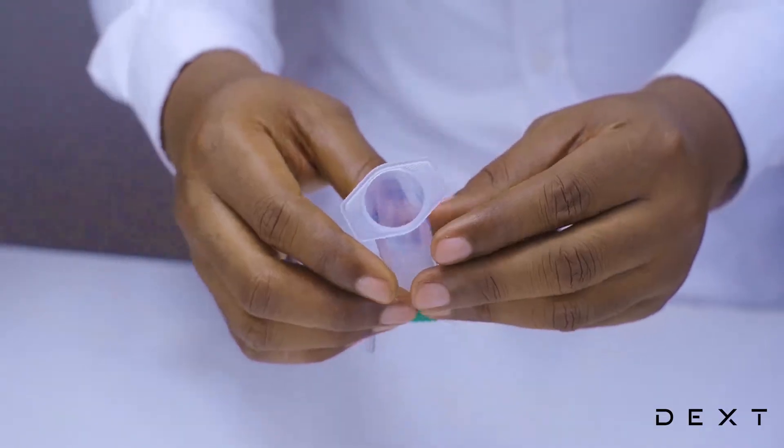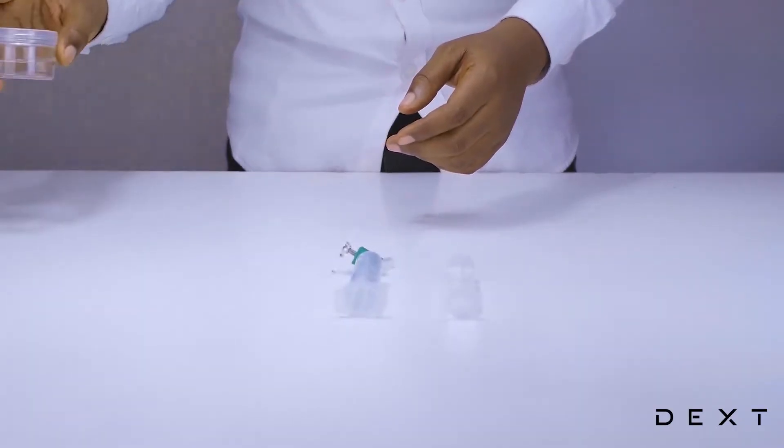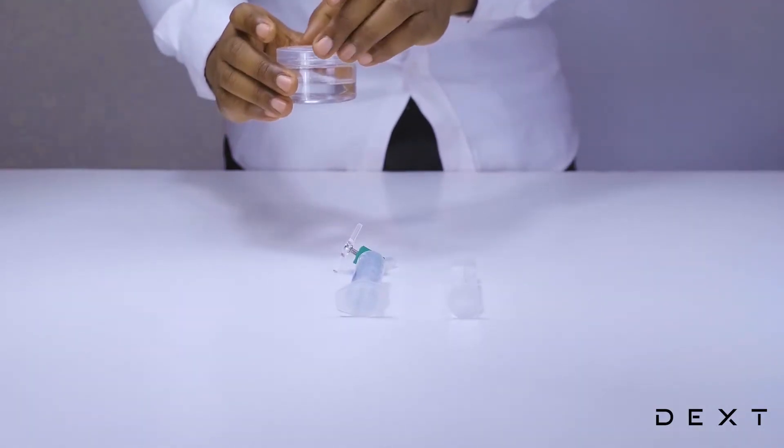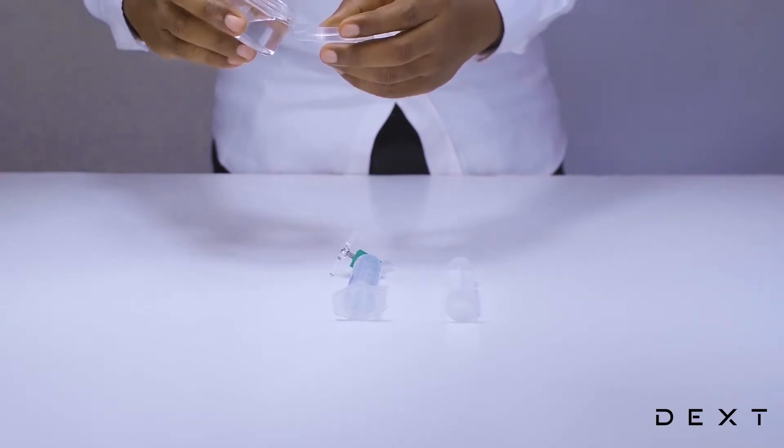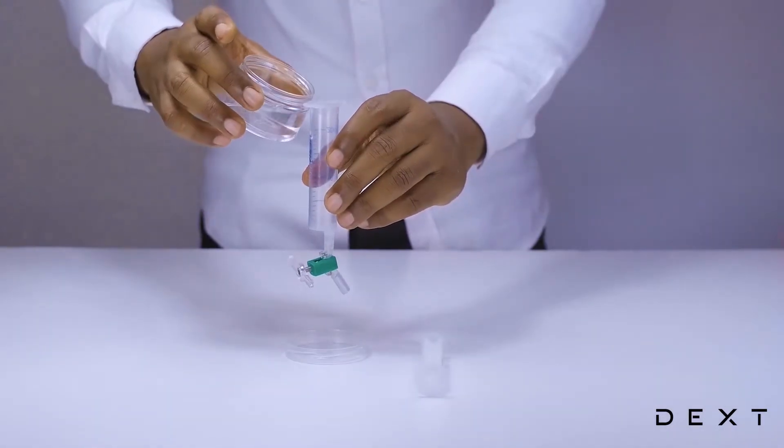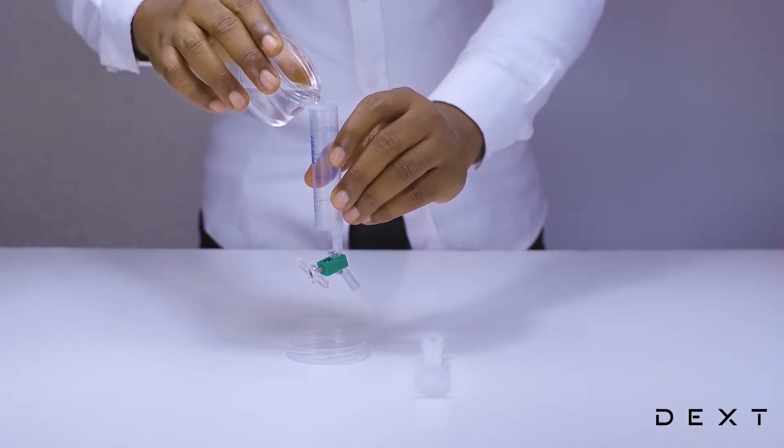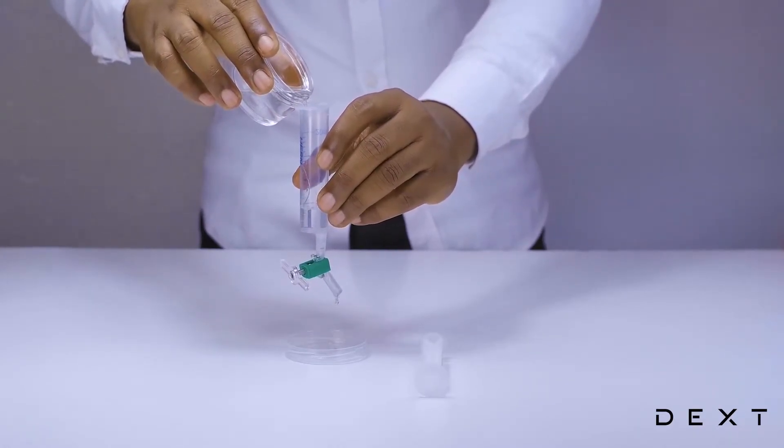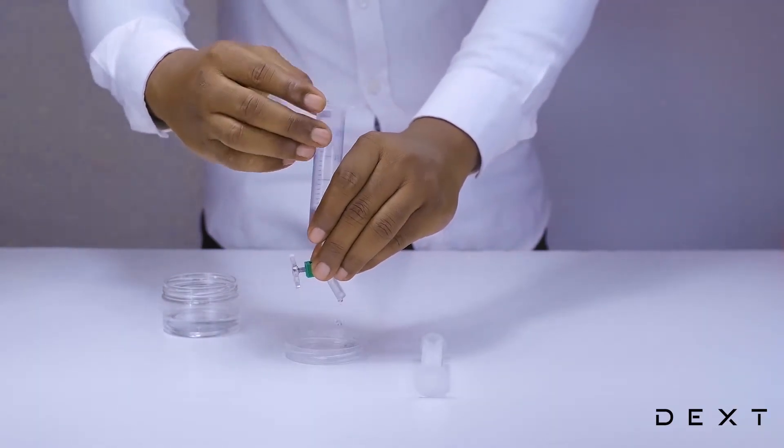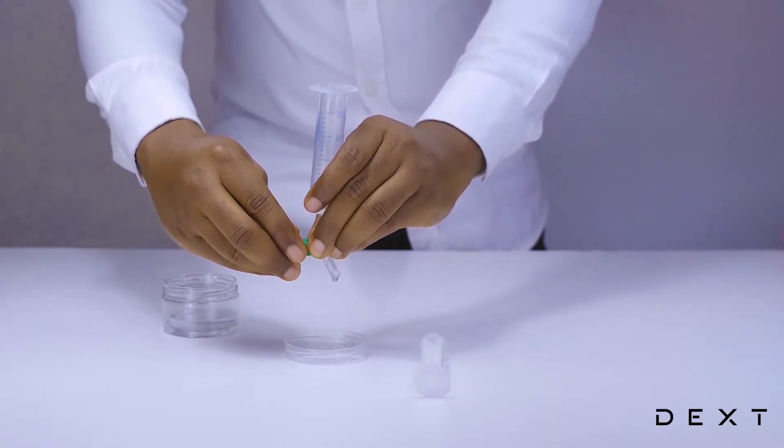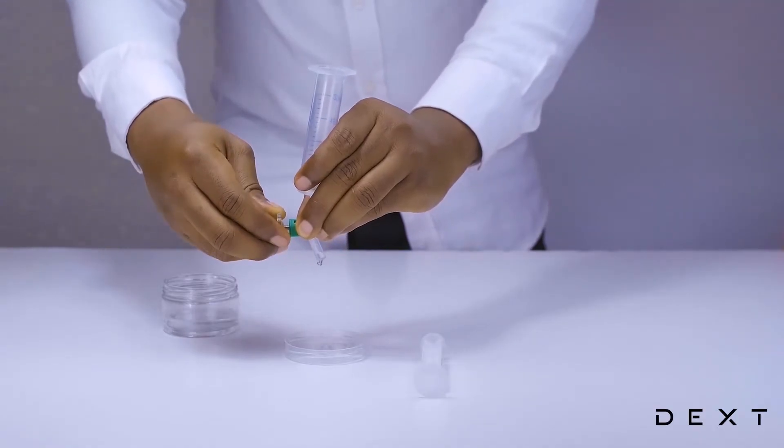The next thing we are going to do is to test our improvised separating funnel. We are going to do that by pouring just a little bit of water through it. We will gently pour some water. And it is very likely that you are going to see the water is dripping. No problem. We just tighten our tap a little bit more until the water stops dripping.